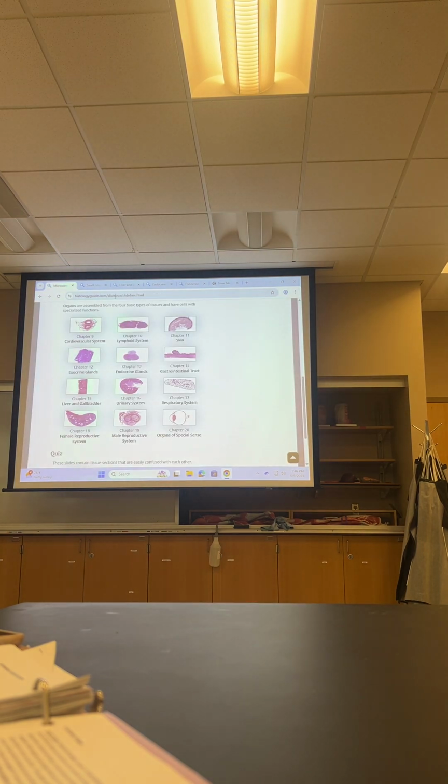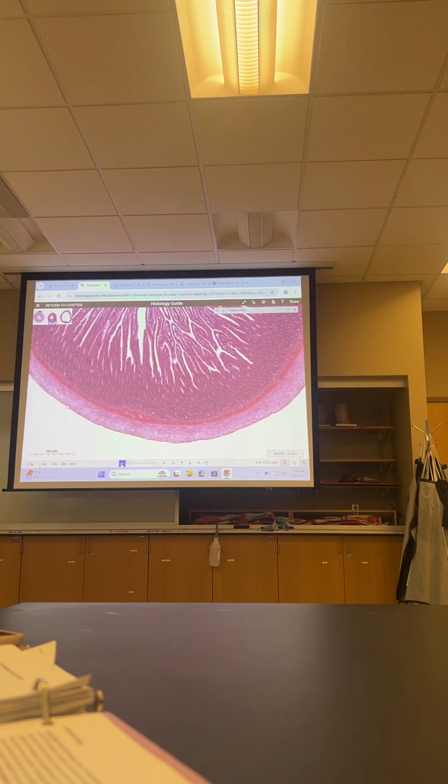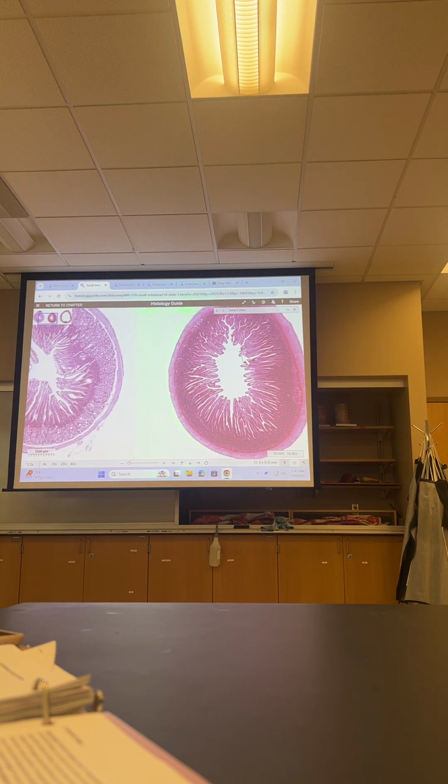Can I open, oh, I could look at both at the same time. So just to compare side by side, see how after the dark purple, that's where the glands start? Here, if you look after the dark purple, there are no glands there. So there are no glands in this submucosa. And so that's how you're gonna be able to tell the difference between the duodenum and the jejunum and the ileum, is that the submucosa does not have those glands.